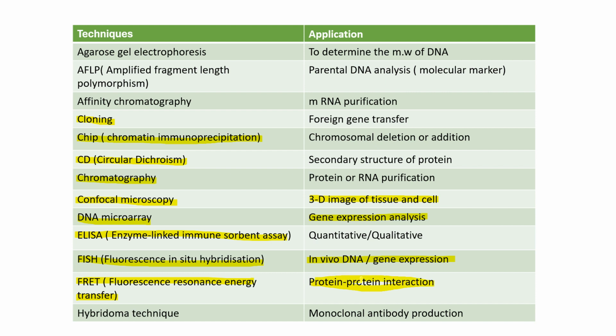There are many interactions: DNA protein interaction, RNA protein interaction. There are various types of interaction. But protein protein interaction is identified by the FRET technique, that is fluorescence resonance energy transfer.